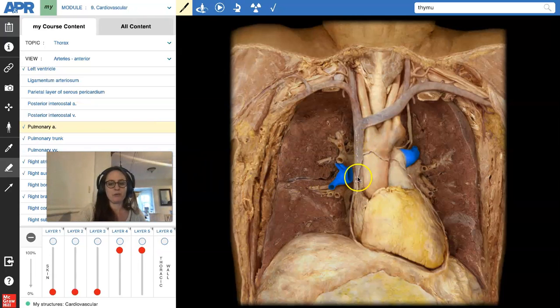So that's part of why when we remove this heart, we can't get those pulmonary arteries branched out anymore without getting deeper into this lung tissue. They're going to be cut off short no matter what you do. The aorta, you've got a choice. You can cut it here, and the dissection guides always have you cutting it as close to the heart as possible for some reason, or you could cut it here and get this arch and those arch associated arteries there, which would be more fun.